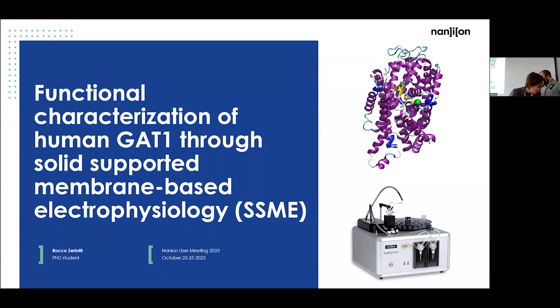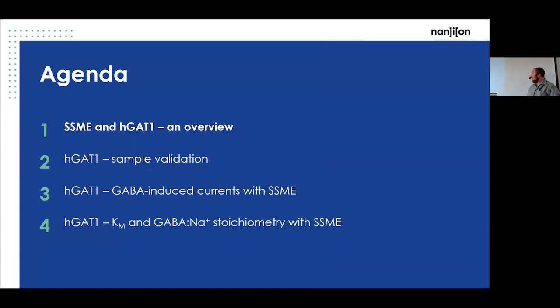Okay, thank you, Ceci, for the nice introduction. So, today I would like to talk to you about the functional characterization of the human GAT1 that I did mainly with the SURFER technology, so the solid supported membrane-based electrophysiology.